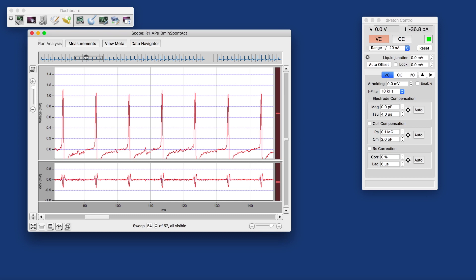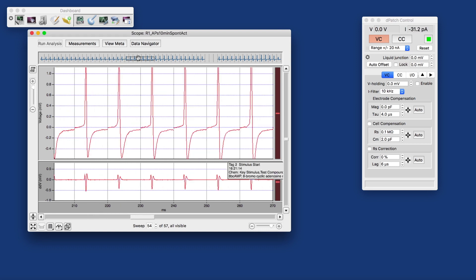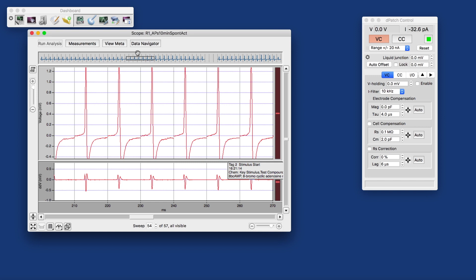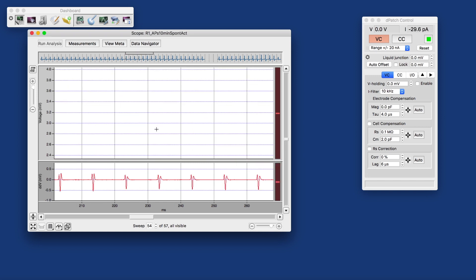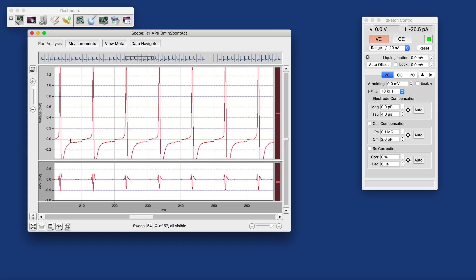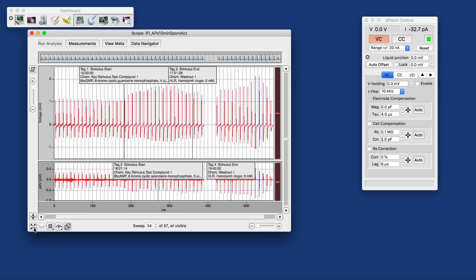Up here we have what we call the overview navigator, which not only shows you where you are in the context of the whole recording, but also lets you drag the portion where you are. Once you may have lost your signal because you zoomed in too far, you can recenter it here with this button without rescaling the y-axis — there's probably a reason you zoomed in. You can also auto-scale the signal, auto-scaling both the y-axis and the time axis.